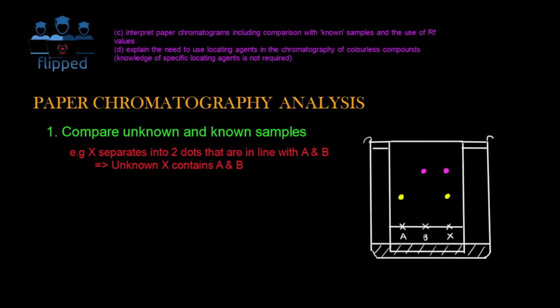Hello, welcome to Flipped. So today we'll be analyzing paper chromatography, and there are three ways to use the results for paper chromatography. First one is to compare known and unknown samples.